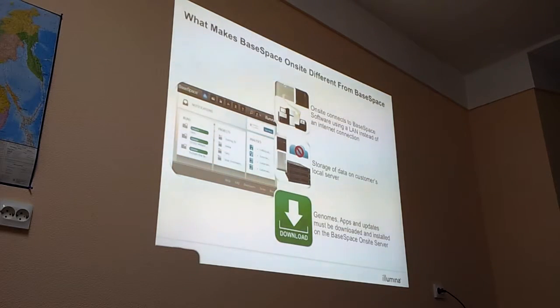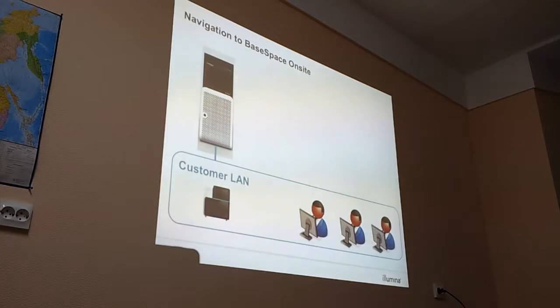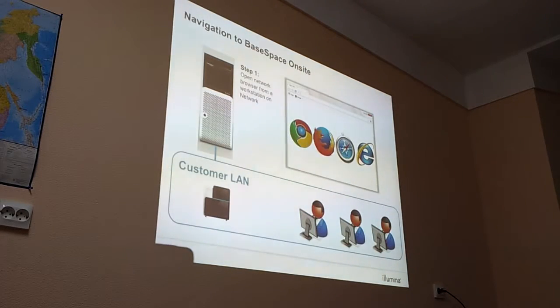When you register an account with Illumina, you should regularly get these Illumina notes, these updates, and please read them, because there we will inform you about any updates and new things. Yeah. So if you know about it, then you can get the download. But be aware that there will be updates.